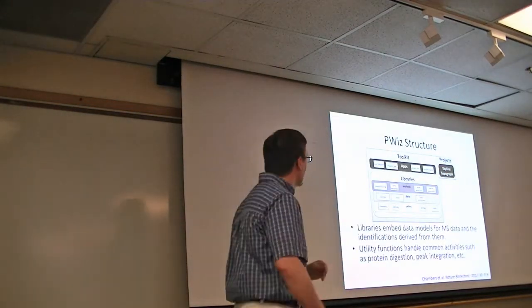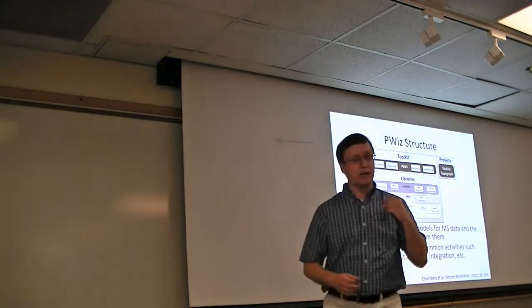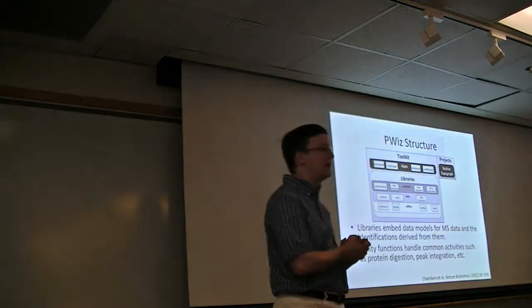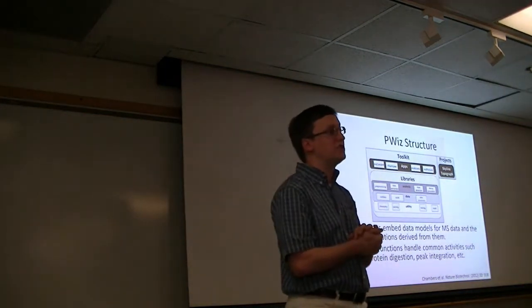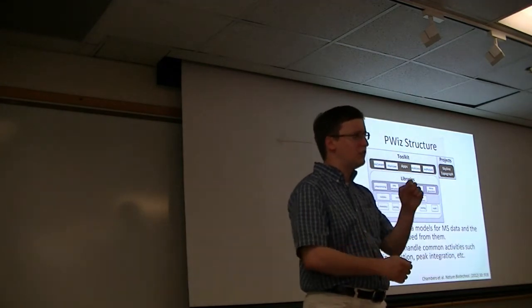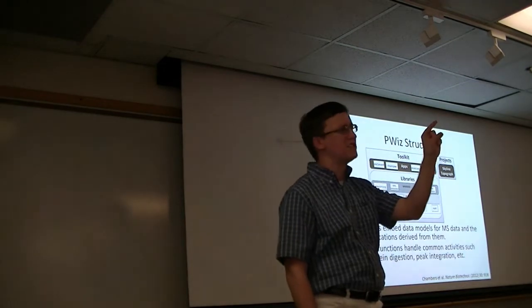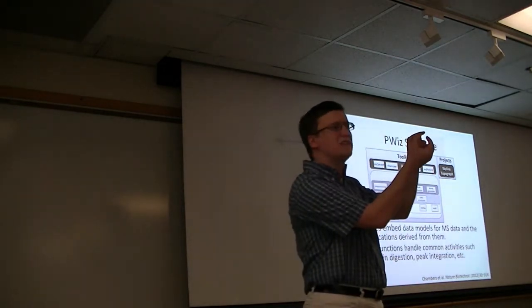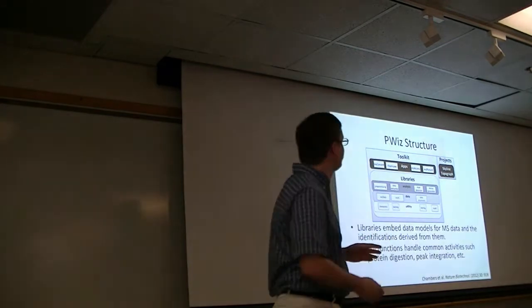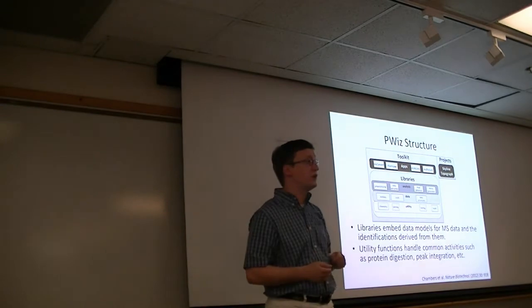All right, we have things like MSAccess, which are very good for getting access to particular bits of information within the mzML file. For example, you may want to pull out the intensity associated with this particular window of retention time between this many minutes and that many minutes, between this and that m/z value. Just pull out an intensity. MSAccess will do that for you. So these are basic tools that are distributed with ProteoWizard.